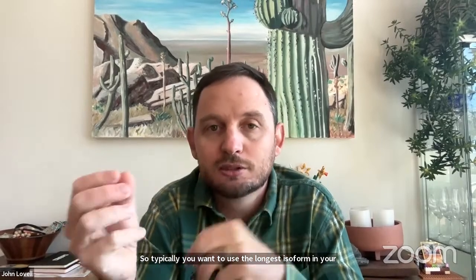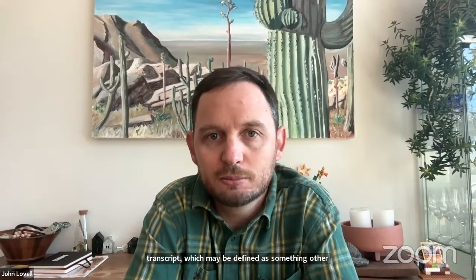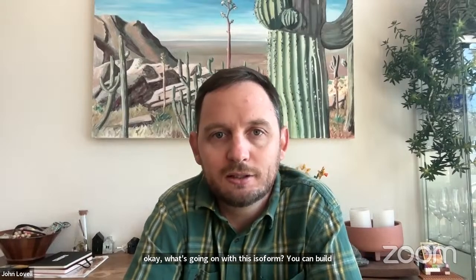The parse annotation function does that and chooses the longest isoform. Or you can do it custom and choose a primary transcript, which may be defined as something other than the longest, maybe the most common. That's totally fine too. But I strongly discourage using multiple isoforms in the analysis initially. After the fact, if you have an isoform of interest and you want to ask what's going on with it, you can build a gene tree with that and do that in a custom way, but I wouldn't use it in the default specifications.